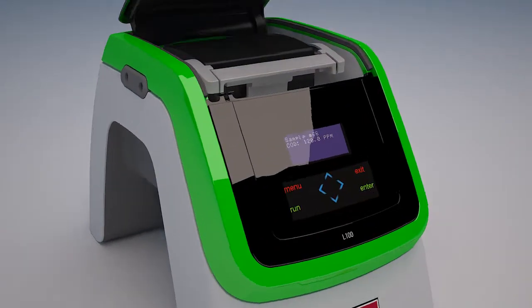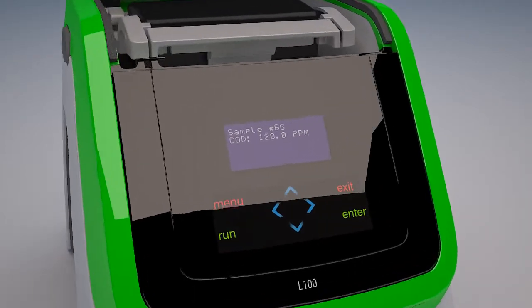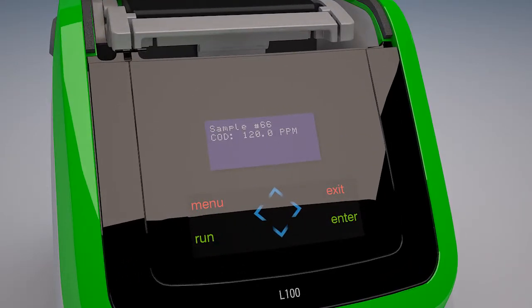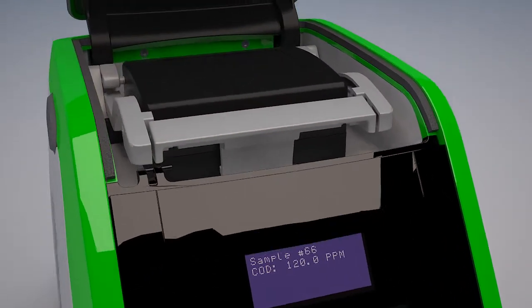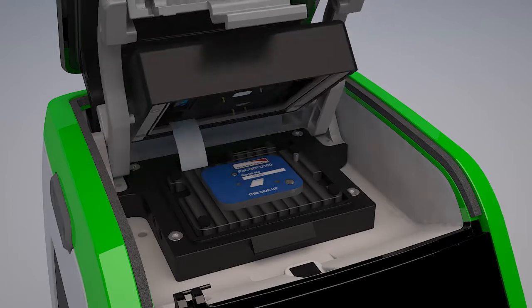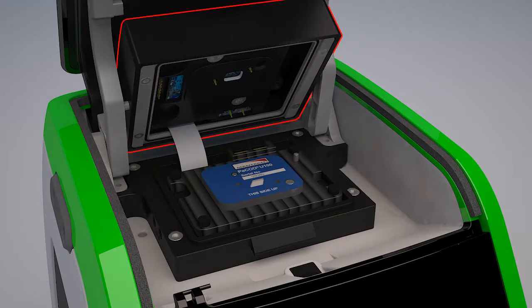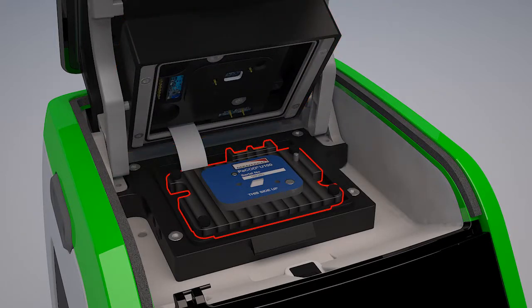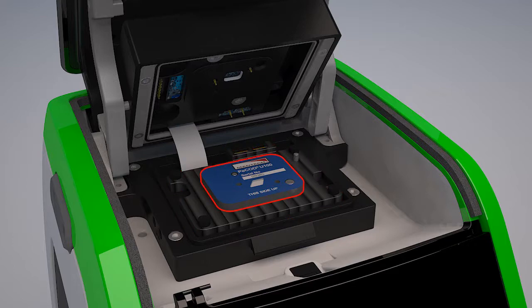A PCOD analysis unit consists of an operator interface, analyzer board with UV light, an electrode block, and titanium dioxide sensor.